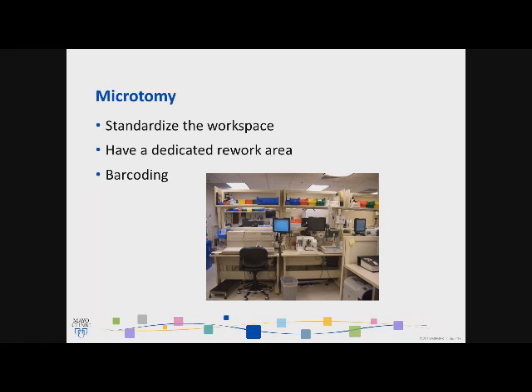You can see here that we try to have buckets that have color coding. In these color coding buckets, we try to place the same type of supplies in each bucket, and we replenish those buckets daily so that there is a very lean workflow.